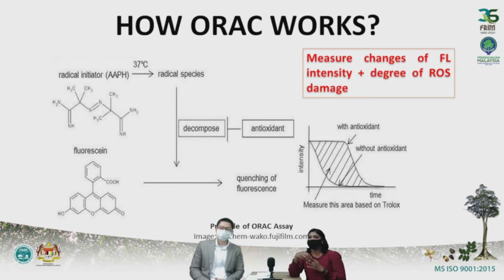So that's all about the ORAC principle, Joko. Okay, to simplify it for those of you who maybe have never heard of ORAC before, if we have a sample that has a high antioxidant capacity, then you will see that the fluorescent signal goes down later, so it will last longer. If the sample has a lower antioxidant capacity, then the signal goes down faster. Yes, so this difference is what we are measuring. Yes, exactly. And we are using Trolox as an antioxidant standard.